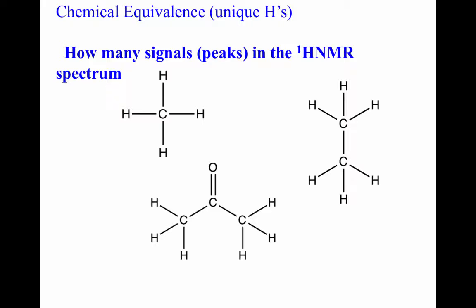So take a minute, pause the screencast, and see if you can say how many signals or peaks are in the HNMR spectrum for each of these three molecules. How many unique chemical environments will they have?